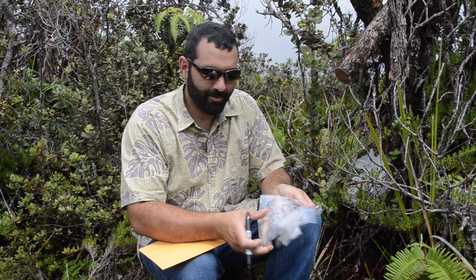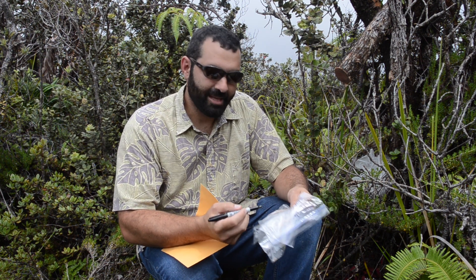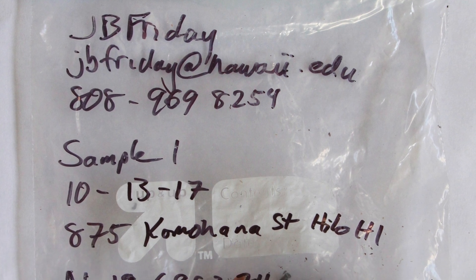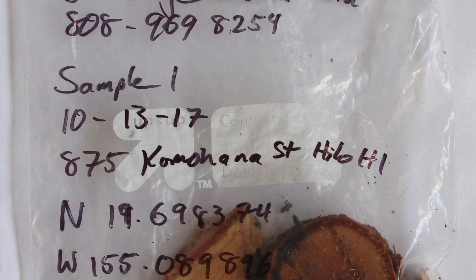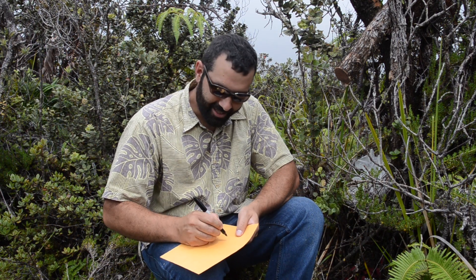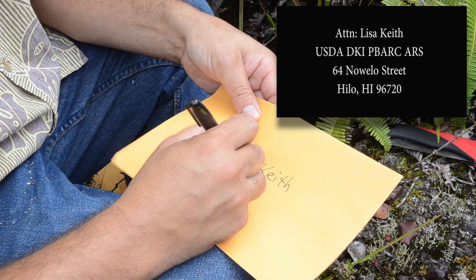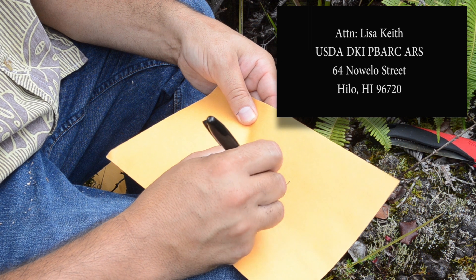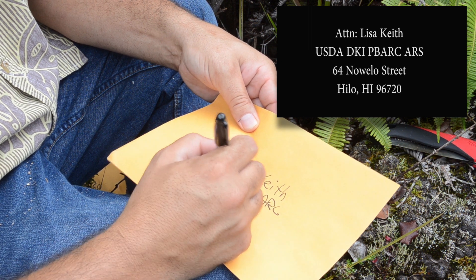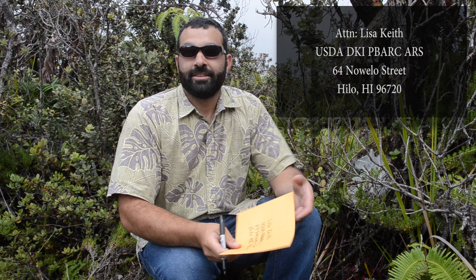Now we've collected our samples and we're ready to pack them up to send them off to the lab for testing. On your sample bags, you want to be sure to label them with your name, the date, the address or GPS location where they were collected, and a way to contact you. For samples collected on Hawaii Island, they can be mailed directly to Lisa Keith at the USDA Pacific Basin Agricultural Research Center, 64 Noelo Street, Hilo, 96720. For any samples collected off Hawaii Island, they can be taken to your local plant quarantine branch and they will be forwarded to the lab for testing.